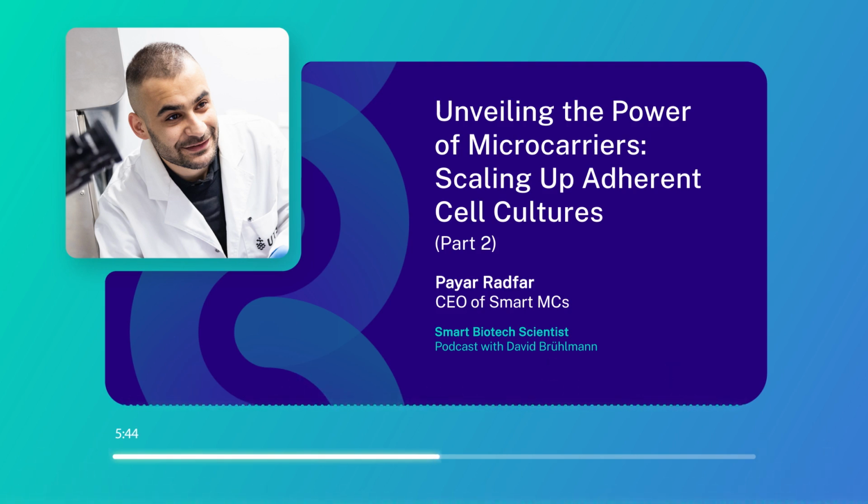The key parts, a lot will be around media formulation, especially in a field like cultured meat, because that plays a huge role in how your cells behave, even for attachment and then the growth for adherent cells, I'm talking particularly. The media formulation of different things is going to be a huge emerging factor.